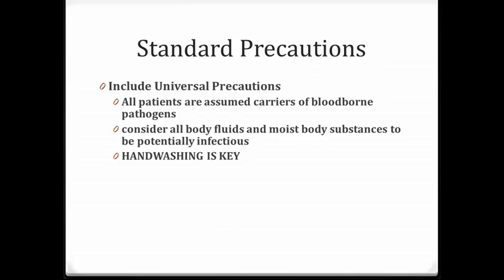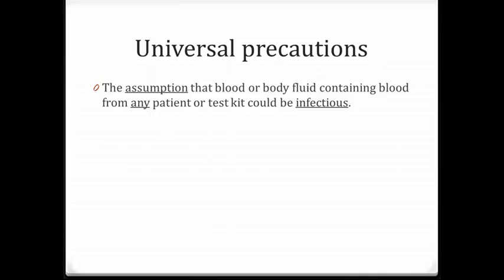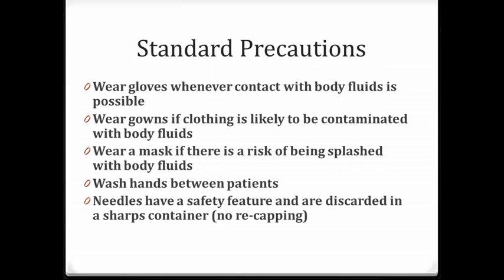Standard precautions include universal precautions, where all patients are assumed carriers of bloodborne pathogens. Consider all bodily fluids and moist body substances to be potentially infectious — hand washing is key. The definition of universal precautions is the assumption that blood or bodily fluids from any patient or test kit could be infectious. Wear gloves whenever contact with bodily fluids is possible, wear gowns if clothing is likely to be contaminated, wear a mask if there is a risk of being splashed, wash hands between patients, and needles are discarded in a sharps container.